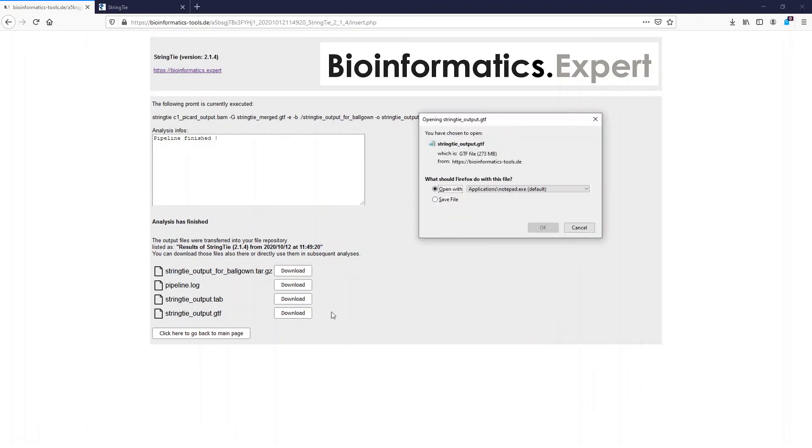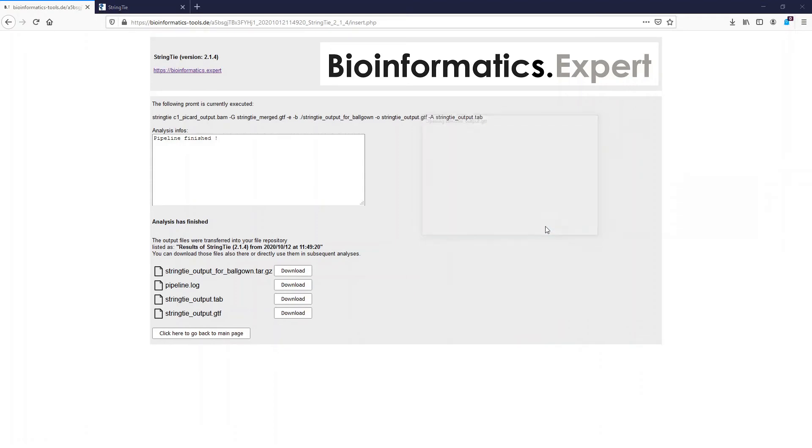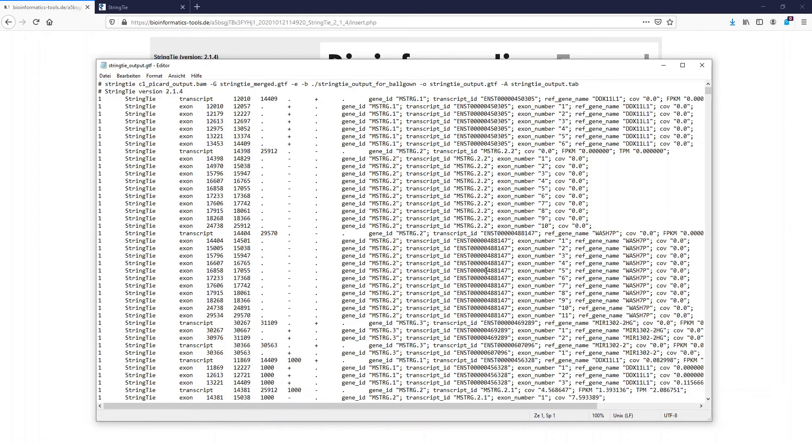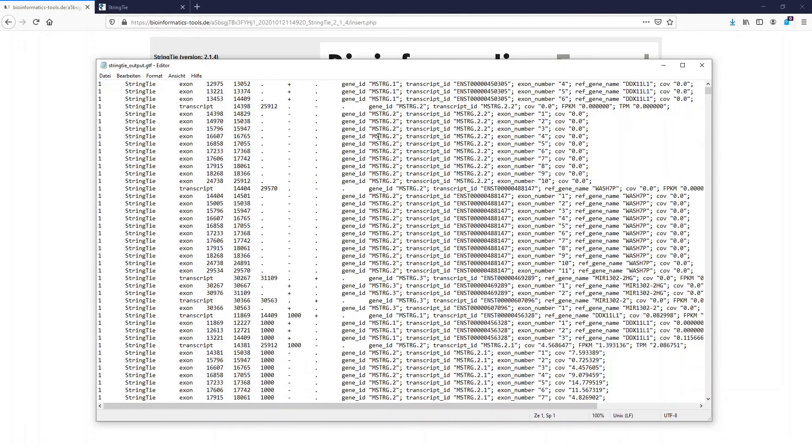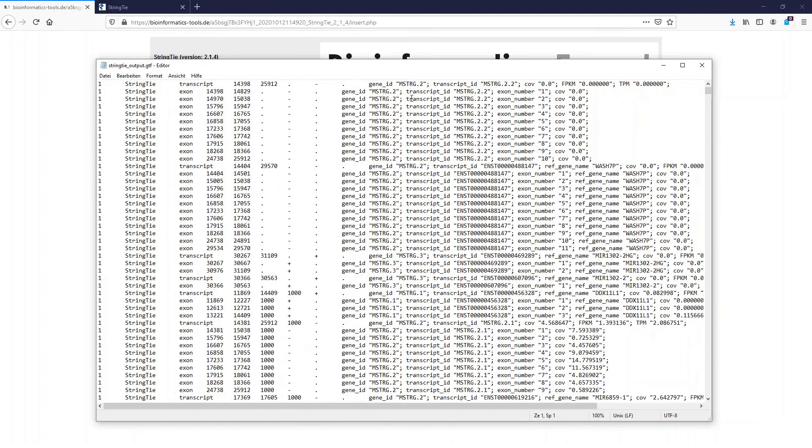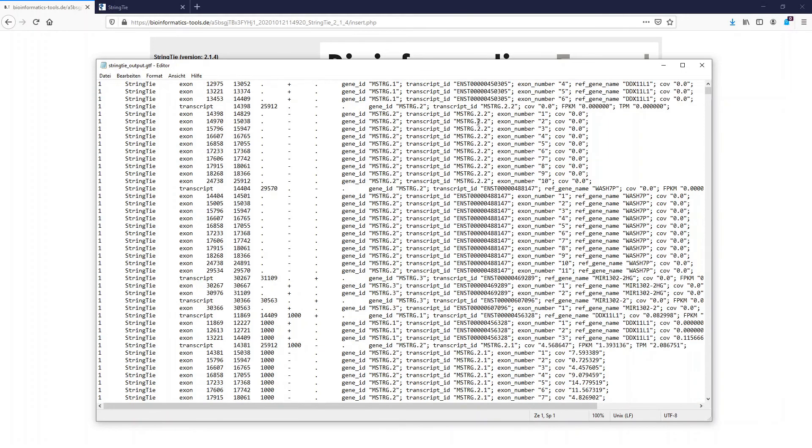In contrast to the GTF files from the previous StringTie run, this GTF file now contains the merged information from all samples. We see the information of transcripts, we see for example the location of the exons. We also see that StringTie gave some of the transcripts a new ID, but we also see that these correlate with already given IDs from the Ensembl database. However there are also transcripts which do not have an Ensembl ID. That means those transcripts can be potential new transcripts in the sample set.